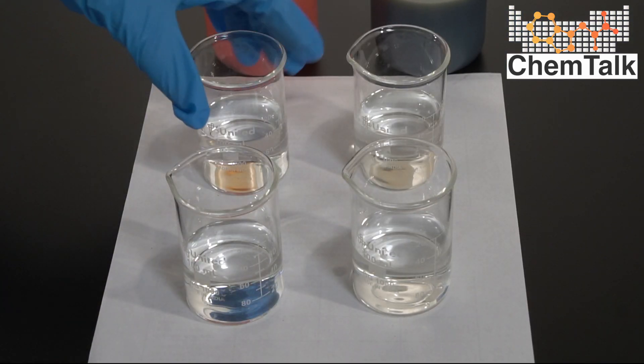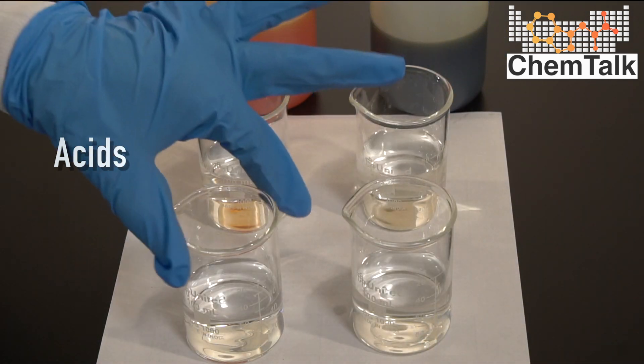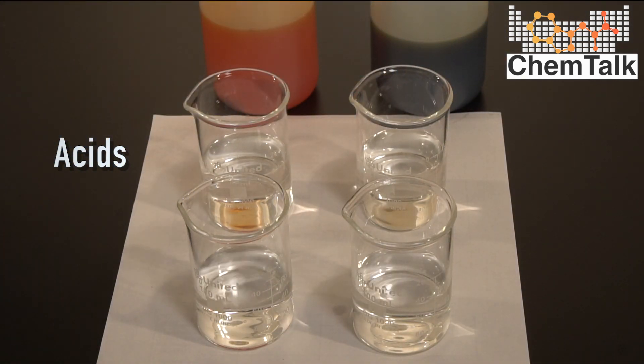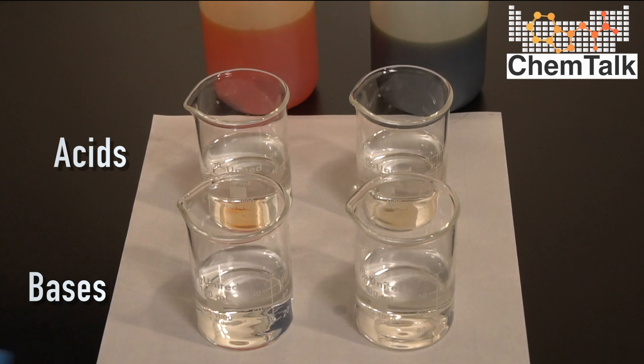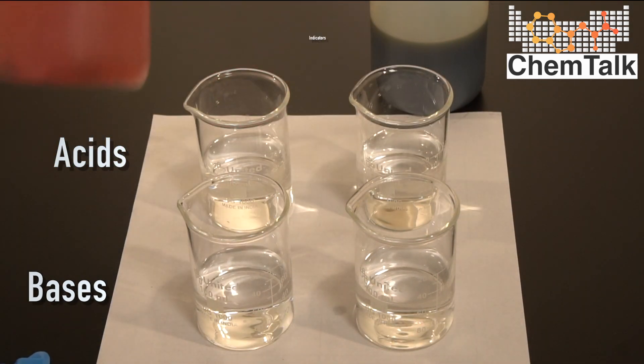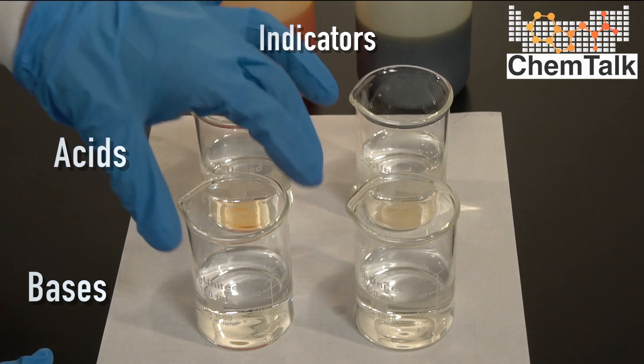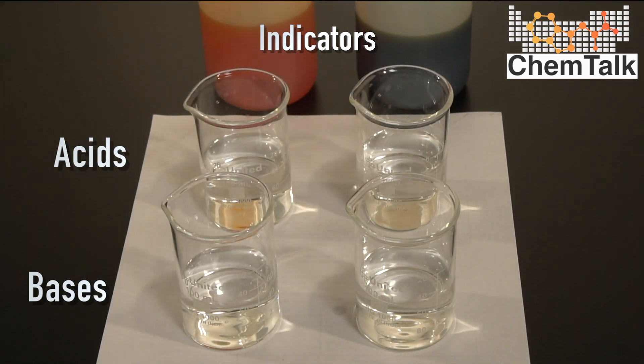So here I have two samples of acid. Acetic acid is in these two beakers and in here I have a solution of potassium hydroxide. We got our acids and our bases. And what I'm going to do is put the phenol red indicator and the bromothymol blue indicator into both the acid and the base just to see what color we should expect.